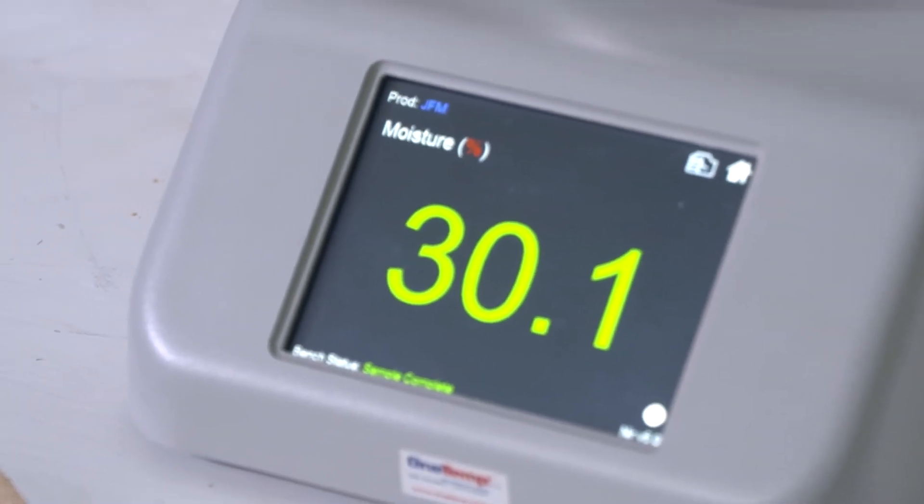So one of these - a fair investment? They are a fair investment. A contract processor could come in and use this sort of thing on site, and it's all about getting your maximum yield. So this will determine that.